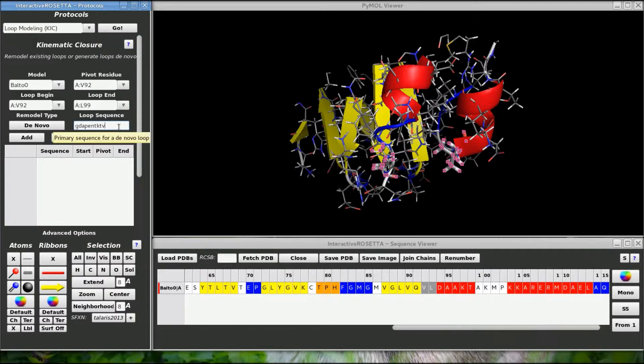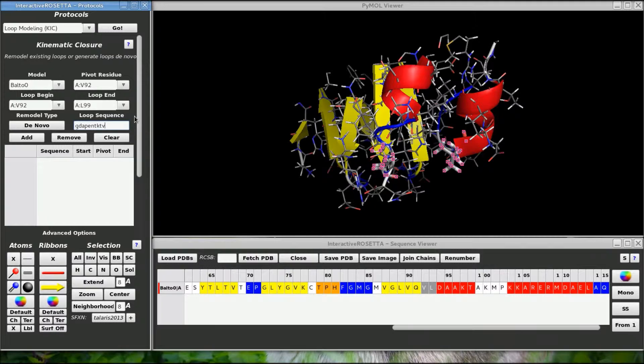If your loop is too short, it will not be able to span the distance between the two endpoints, so be aware of that.